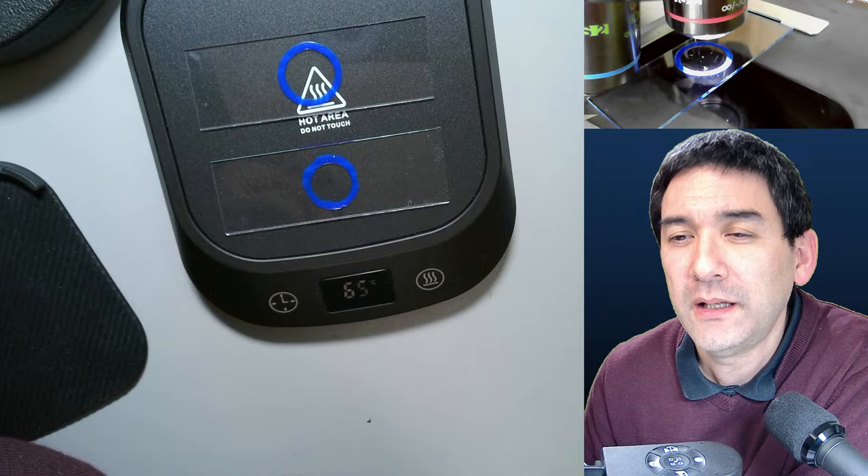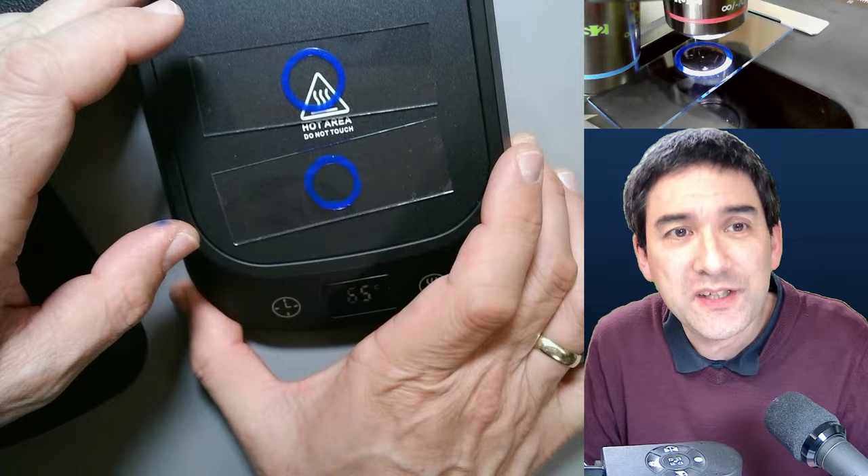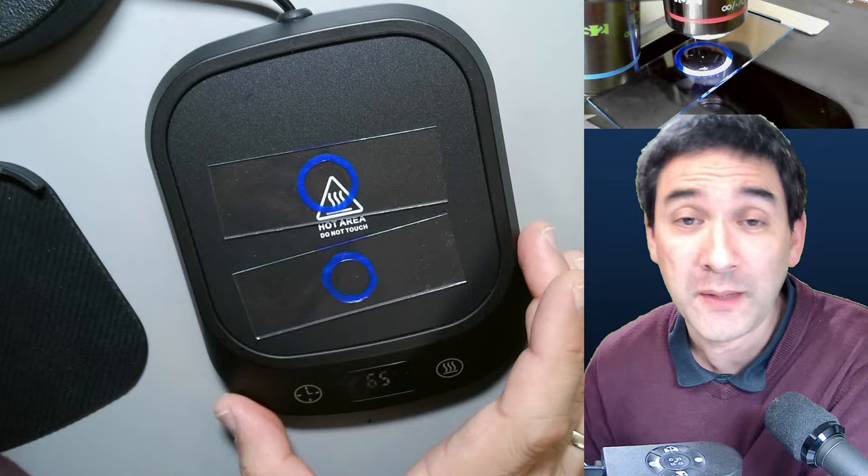What's the difference between the 350T and the 380T? I've made a review on my other channel. The difference is generally not that big, but the 380T seems to be a little bit bigger and more stable, and I think the optics are also slightly better. Is the coffee warmer USB powered? No, this one is not USB powered. Many coffee warmers are USB powered, but I chose not to go that route for several reasons.